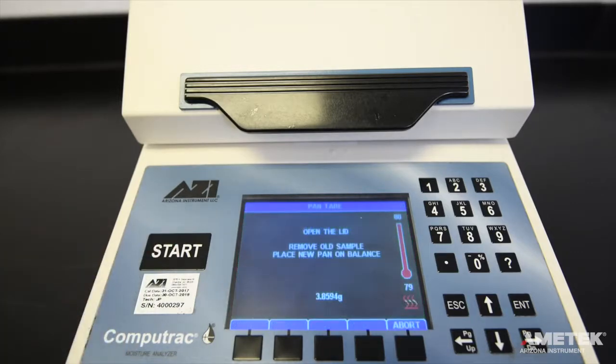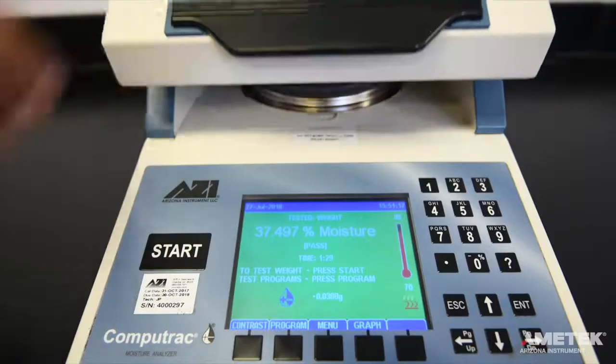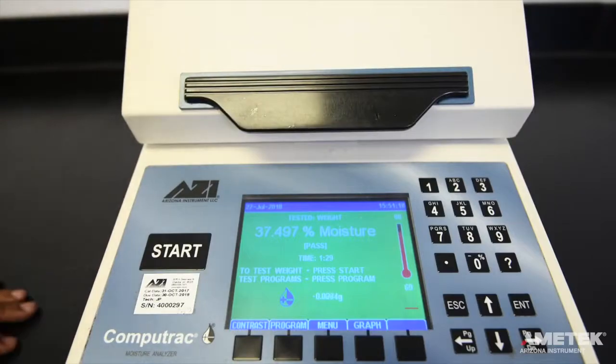The instrument will prompt you to remove the old pan and place a new pan on the pan support. If the existing pan is clean, for example, if it was just used to perform the span calibration, it can be used again. Simply remove it momentarily, then place it back on the pan support before closing the lid.